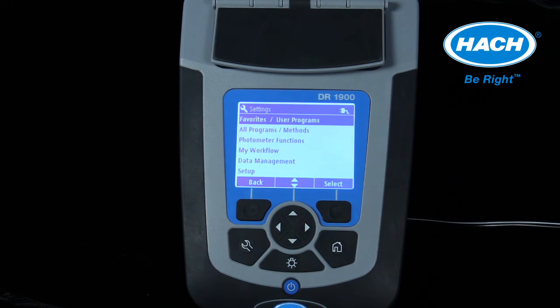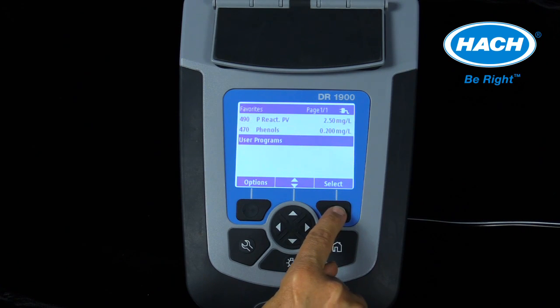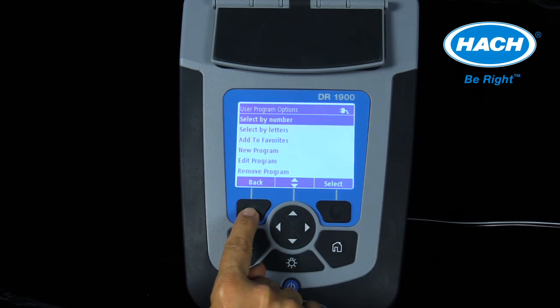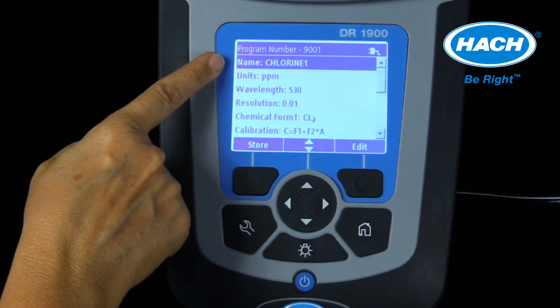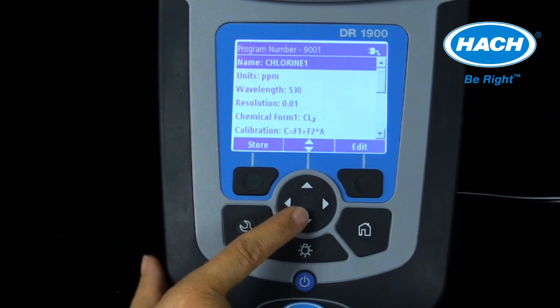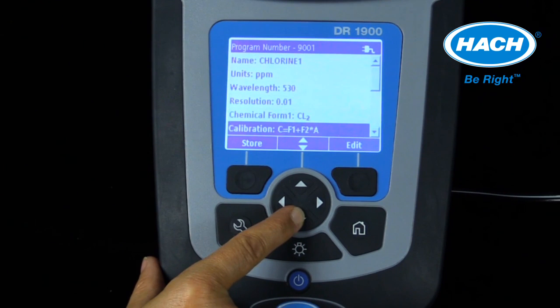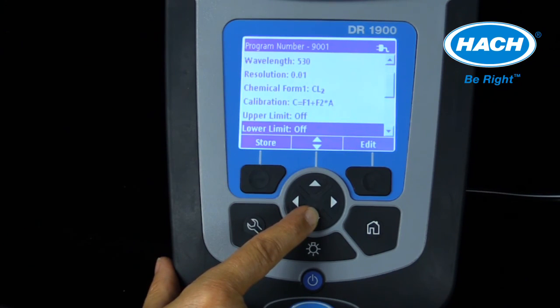The DR-1900 is received pre-programmed. However, the software allows for 50 user entered programs and methods, including 12 data points, linear or piecewise curve fit. Entering in a user program is simplified as the software walks you through each step, starting with a program name, concentration units, wavelength selection between 340 and 800 nanometers, resolution, and chemical form. The formula can either be entered or calculated based on analyzing primary standard solutions of varying concentration and entering in the absorbance values. Upper and lower limits and timers are also available in the software and can be entered.